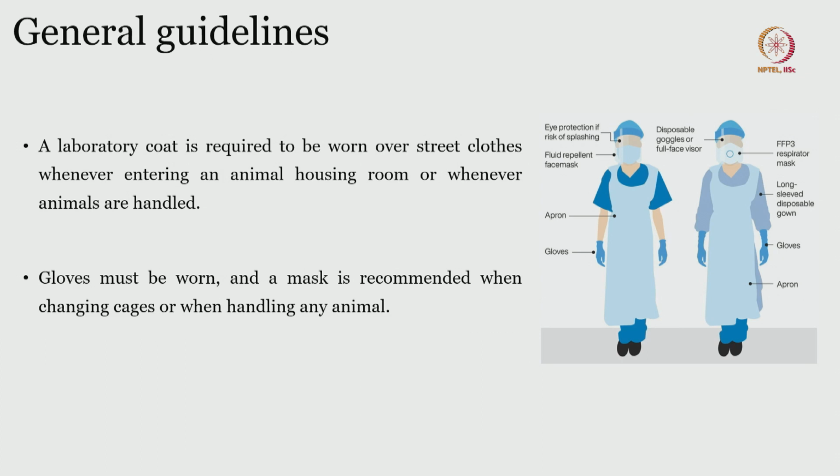There are two things. One is the protective gear that you need to wear while handling the rodents. The next is that if you are going for surgery, which is another aspect of today's session, where you are going to do rodent neurosurgery or any rodent surgery for that matter, it is also important that you do not contaminate the field and transmit microorganisms into the body of the rodent, which will affect your experimental outcomes.